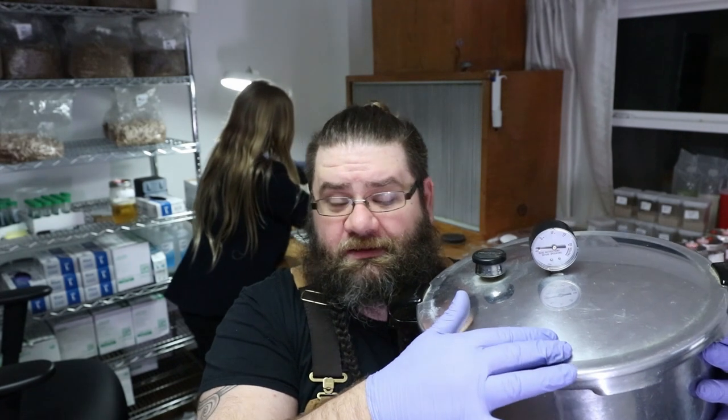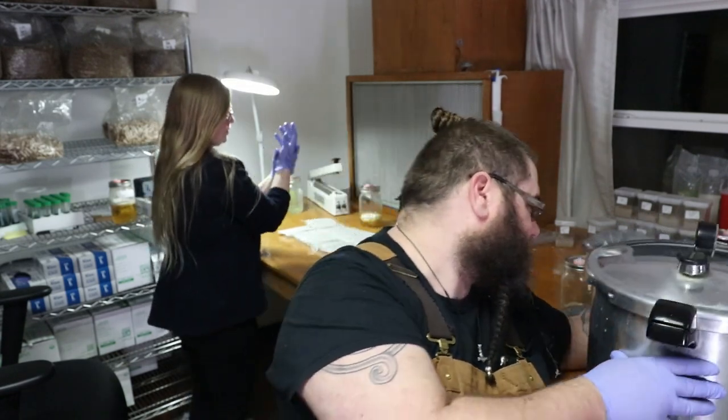Let's see. The main thing on these is you've got to care for them a little bit more. The silicone rings need to be maintained. Every 3 or 4 runs on these, we would Vaseline the silicone band inside. And then they have these little safety plugs. You always want to make sure that those are fitting well. They can dry rot, so sometimes you want to lubricate those too, though sometimes you don't want those lubricated because otherwise they might blow out a little easier. So go easy on that. But read the instructions and follow the instructions more than my advice. That's what I'm truly trying to say.